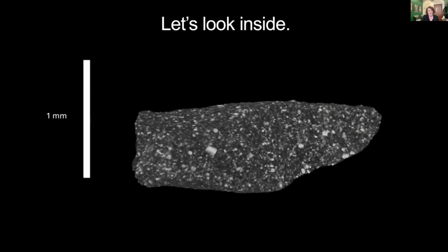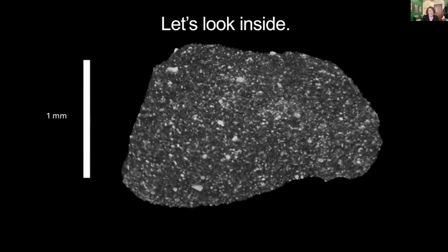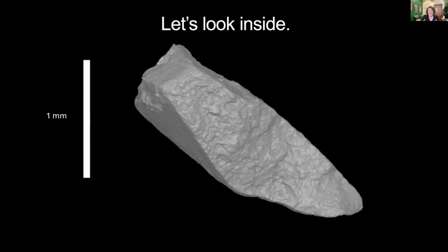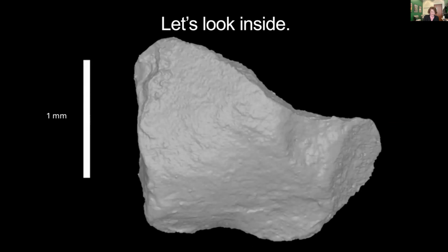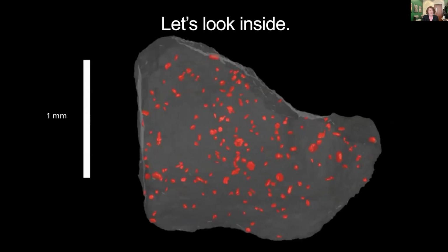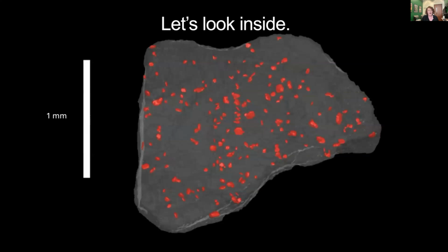So in order to do that, we performed X-ray computed tomography, and this is a 3D scan of one of those Bennu particles that was completed about 12 hours after we got our hands on the first sample. You see there are differences in contrast. That's a result of different chemical composition of those phases. We could also look at the surface morphology of the sample to understand if we could identify any evidence for these space weathering processes on the surface. We're able to pick out the distribution of these high density mineral phases. That gives us an idea of what the bulk mineralogy is and how much of these particular components we had in the sample.